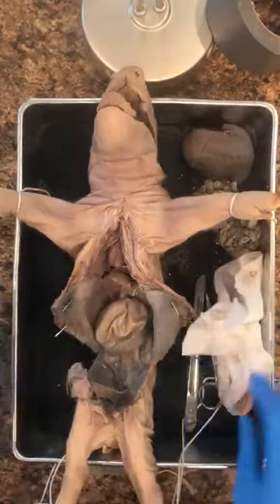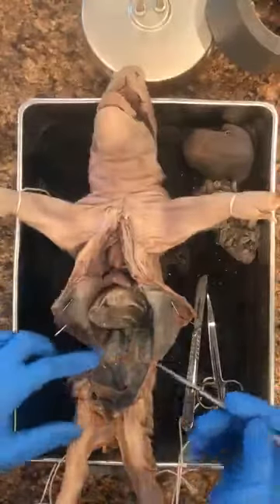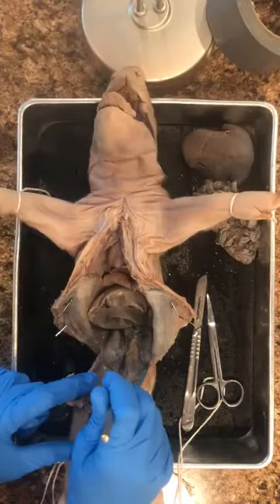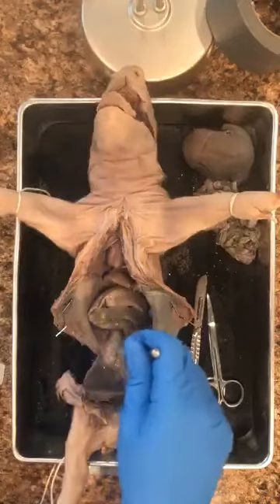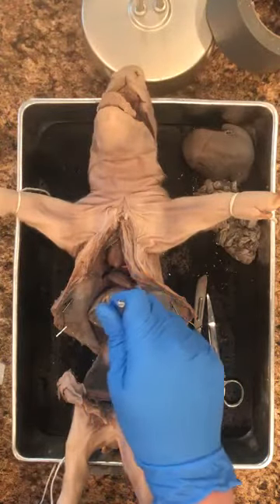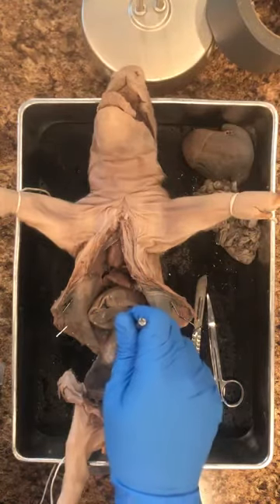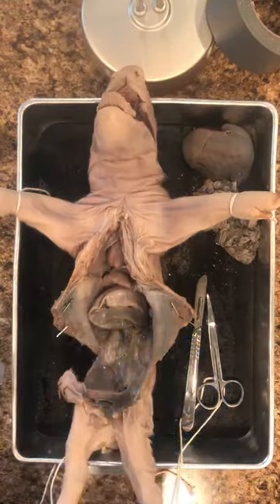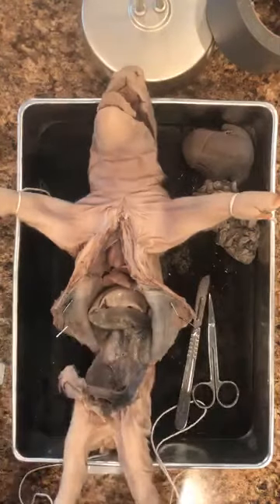Okay, so the large intestine was going to go to the bottom here, which I think I did a decent job. Yeah, okay, so right here is where I cut. This here is the rectum. The large intestine leads to the rectum, which I have my probe in right here. That's the last place of the digestive system where food is going to be, and then it carries the waste out of the anus, way back here, where we have poop coming out.